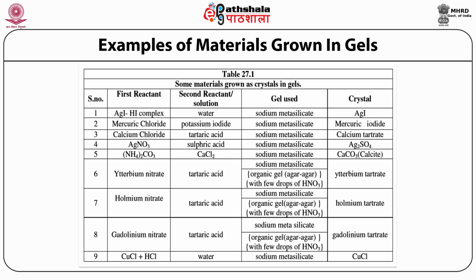Then at serial number 9 is CuCl plus HCl as the first reactant. The second reactant is water. The gel used is sodium metasilicate and the crystal grown is CuCl.